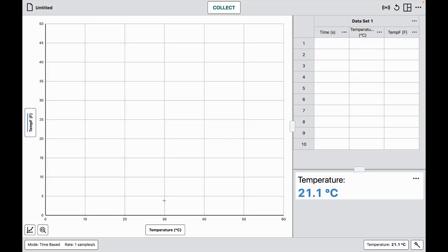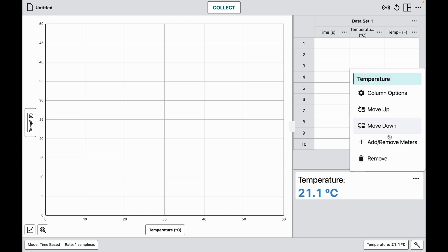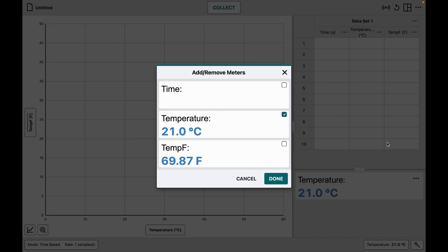It would also be nice to have a meter that shows the calculated column while collecting data. I can do that by hitting the three-dot icon next to my meter and choosing to add or remove meters. I have the ability to choose any calculated column or any column in my data set as a meter, and then I say done.